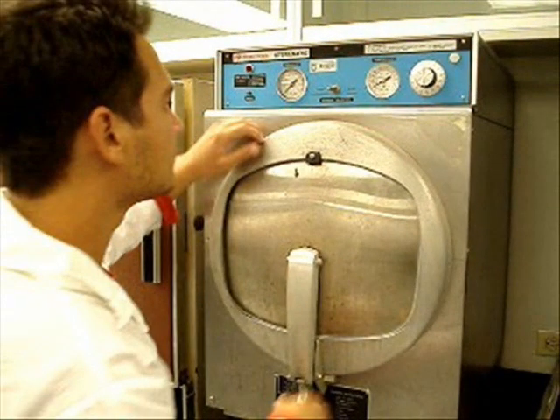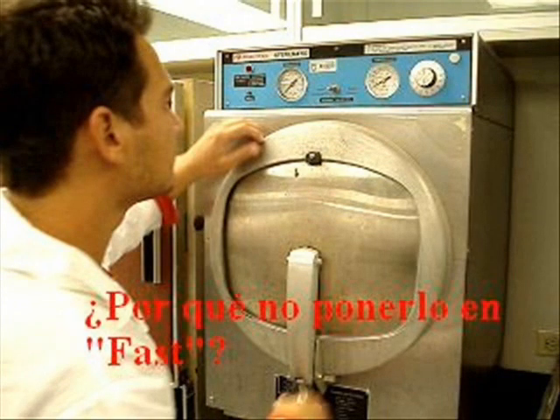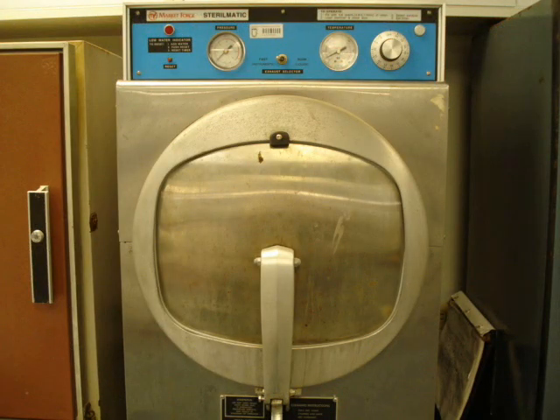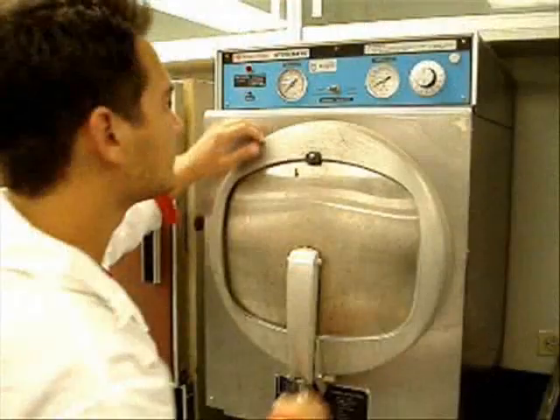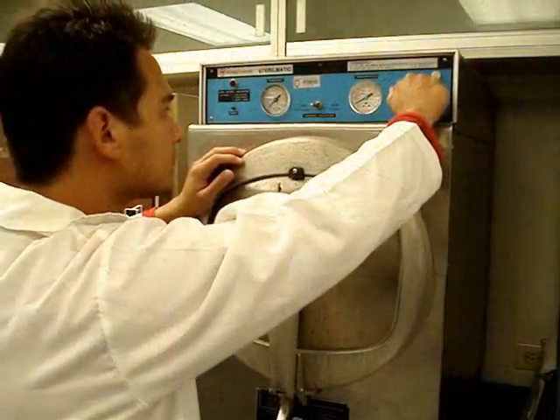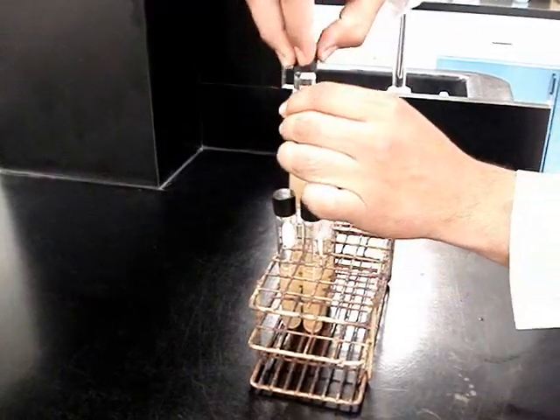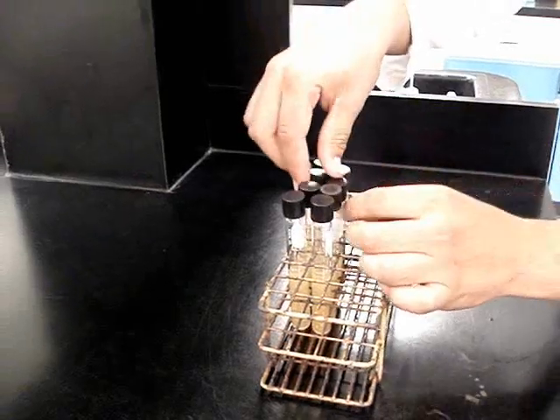Este compañero metió tubos con rosca que contienen agar, no dejó desenroscados los tubos y además puso el regulador de presión en rápido. ¿Por qué no se debe poner en rápido cuando esterilizas líquidos? Los líquidos se expanden al calentarse, convirtiéndose en vapor; si no tienen salida, el recipiente puede tronar. Lo más recomendable es que desenrosques un poco cualquier recipiente para que el vapor formado tenga salida, como lo está haciendo este compañero.